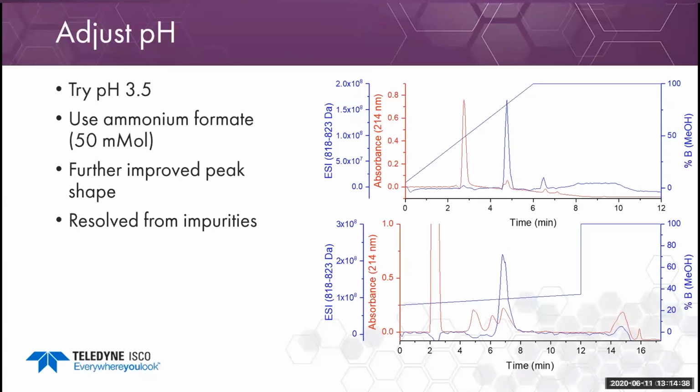I used ammonium acetate and ammonium formate because they are volatile and can be used with the mass spectrometer. Since this is a preparative LC system, only a tiny portion of the flow, microliters at any one time, gets diverted to the mass spectrometer. So I can use 50 millimolar buffer. The buffer gets diluted by the carrier solvent that delivers the sample to the mass spectrometer.